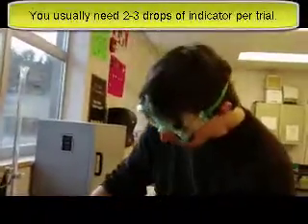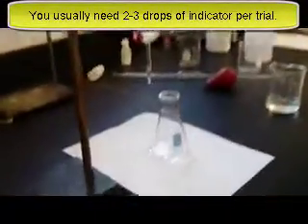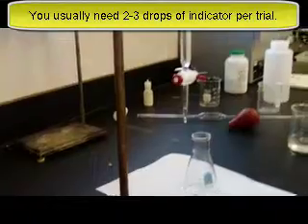Okay, and you'll have little droppers of this lying around the classroom. And phenolphthalein is an acid-base indicator. Now phenolphthalein, I'm going to put about two or three drops in there. And it's clear and colorless when it's in an acid. But it's pink when it's in a base. Okay, so I'm just going to swirl to dissolve that a little bit.